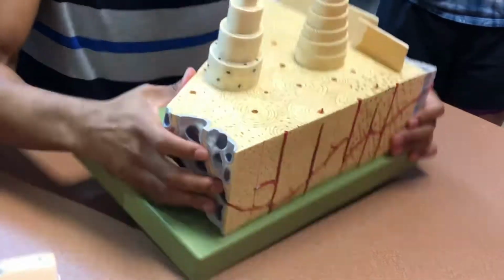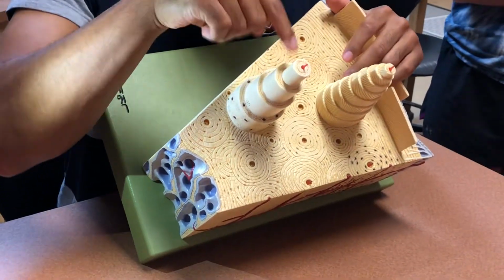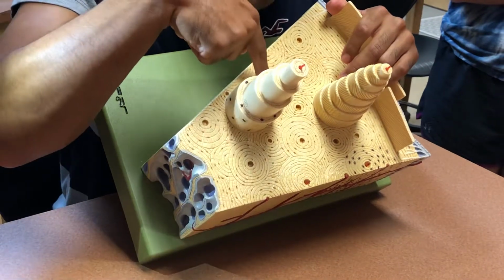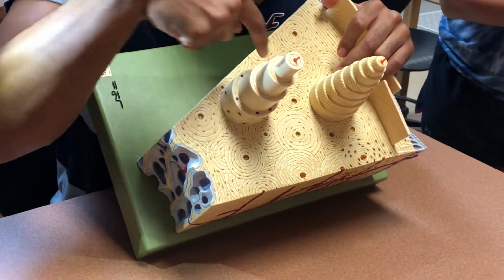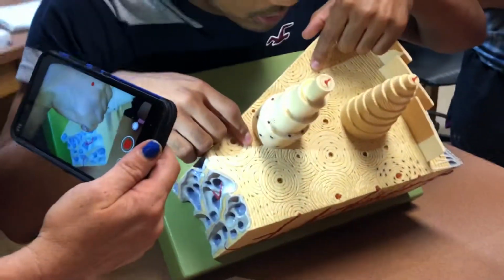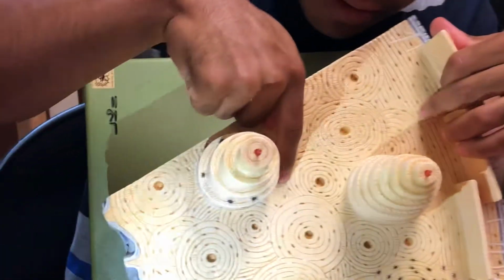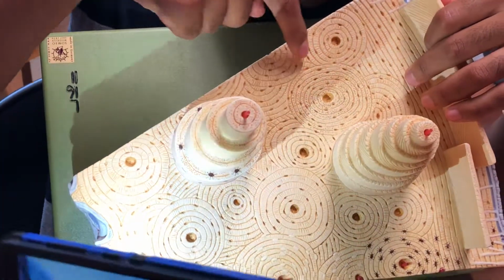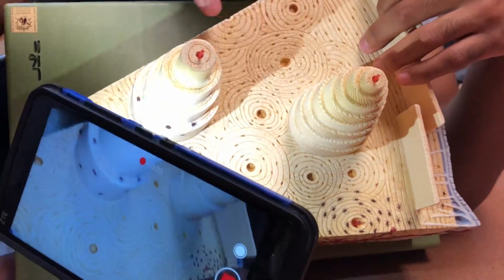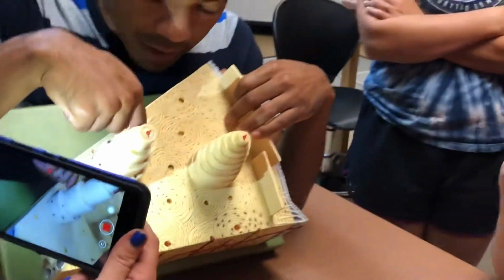Now, in the actual bone tissue, you see how some of them don't look like these guys. They don't look like concentric rings going around. They kind of look like space fillers. Here's another space filler, and another. They're between these little rings.